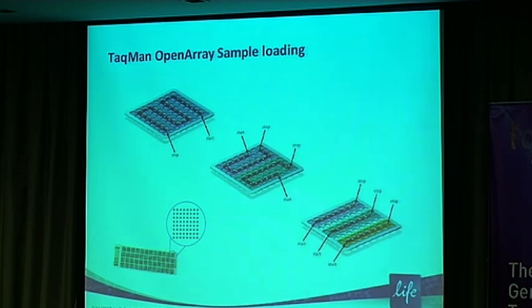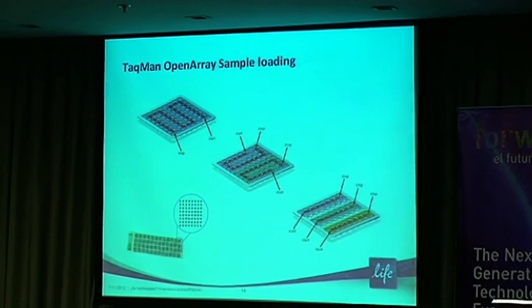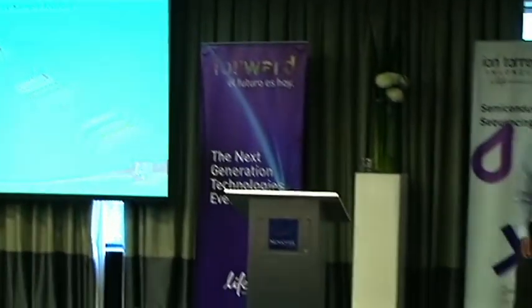So if you think back again, okay, how long would it have taken me to set up 32 96-well plates by hand, manually pipetting with a multi-channel pipetter, and how many sources of error, how many points of error could have been introduced, then you really realize the potential of a technology like this.